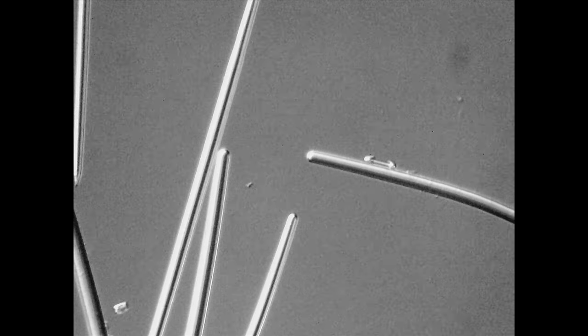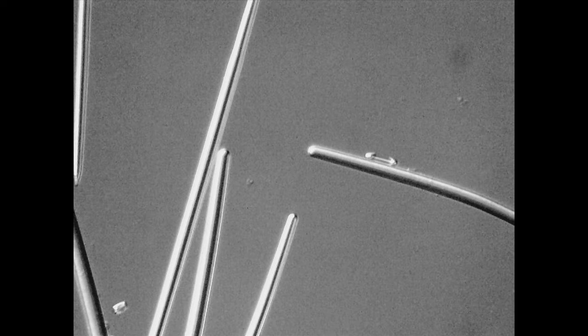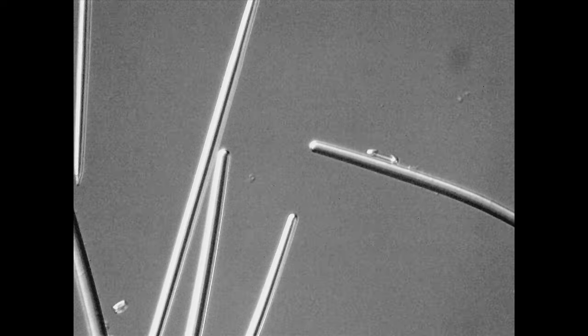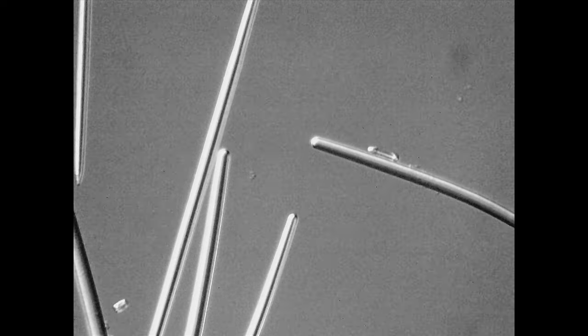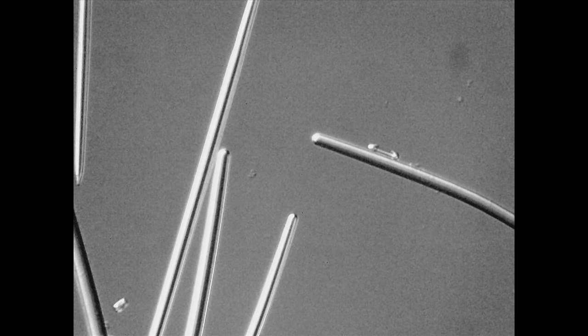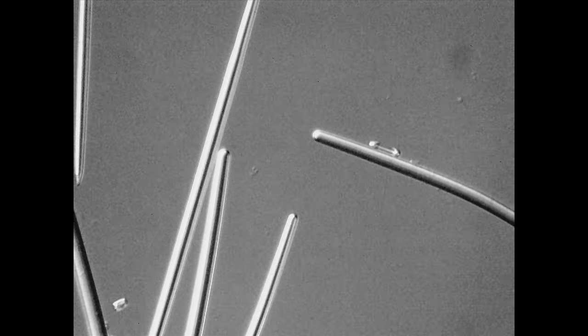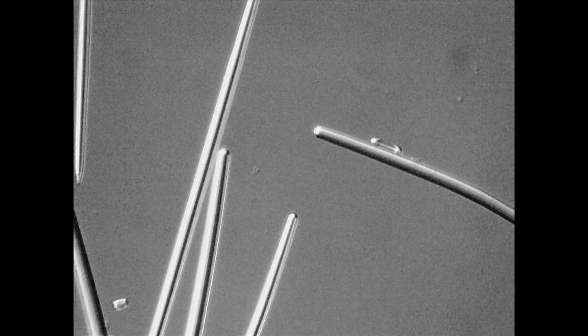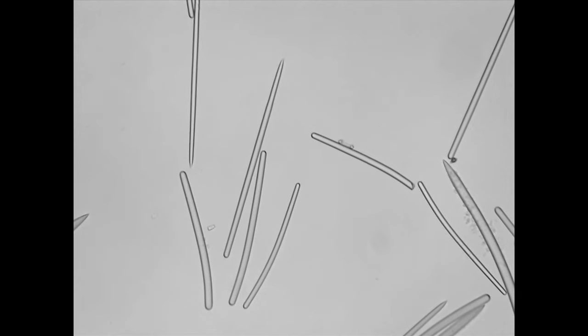Our second slide is Iotrochota birotulata and we can see the very small birotules here. This is at a higher power, this is a 200x magnification. If I go to the previous magnification, which is 100x, you can still see that birotule. The sponge also has a mix of strongyles and styles.